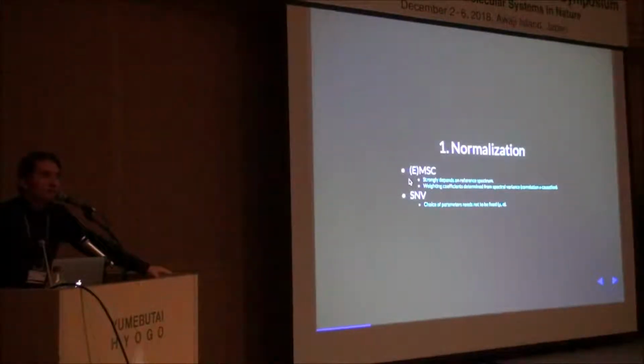But mean value and standard deviation are not law in any way. Instead of the mean value, medians, interquartile range, and different measures of central tendency, statistically speaking, have been suggested. So I would like to advise you to experiment with those. Don't just use things that are in the commercial software. Massart has published a paper on this, which I will try to find, I don't think I have included it, but I will make sure that you get it. They experimented, and they have shown that depending on what kind of mean value you use, you can get different results, and that those results can be better.